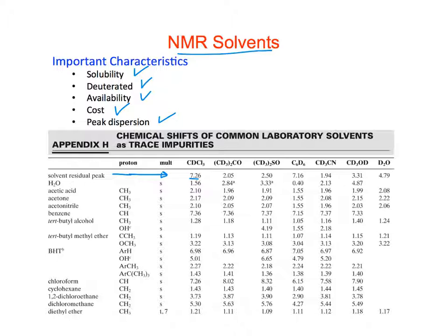Yeah, a lot of these you buy just in single-use ampules, unless you really use it a lot. Because a lot of them will also suck up moisture if they're open for very long. Do you like using calcium hydride under vacuum for yours, or what did you use to keep them dry if you had to?